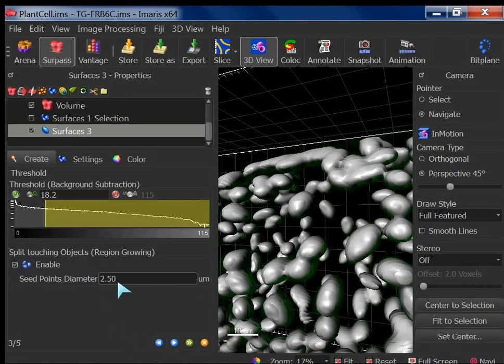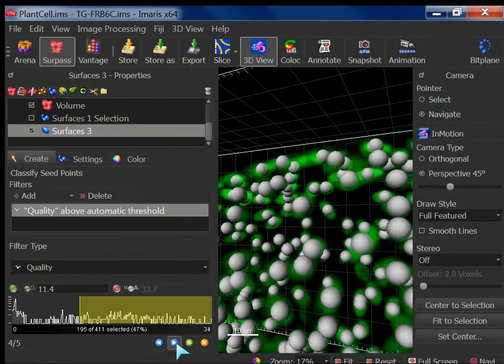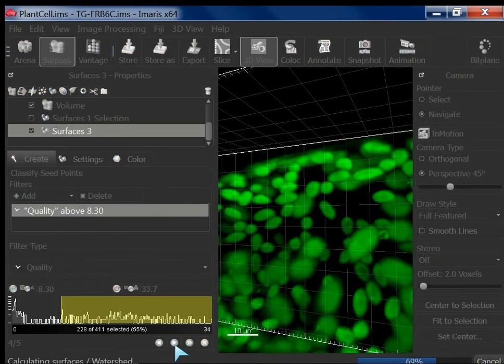So you say enable here, and what did we use? Do you remember? Was it 4 or 5? It was 3 at the end. I think we changed it back to 5 now. Yeah, I think so. Okay, so I'll just go for 5 and then we'll come back. So you use this option if you have uneven illumination, different intensity for different objects, and even if you want the objects to be treated equally, then you have to do local contrast. So let's go for this. That's it.